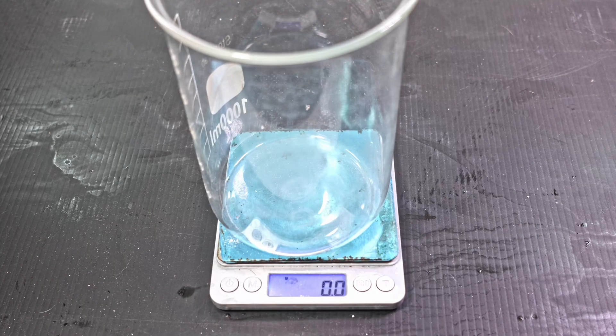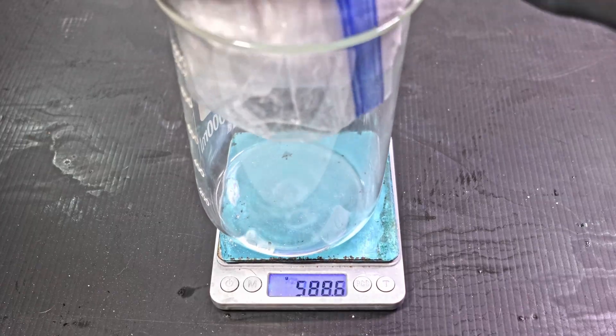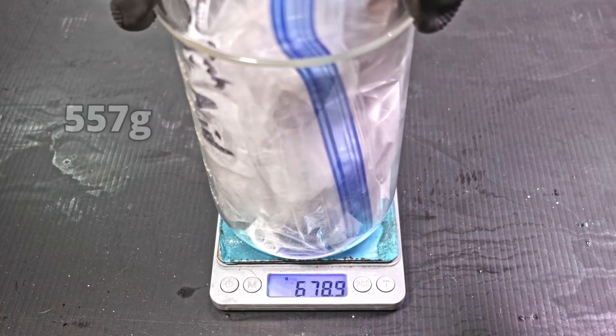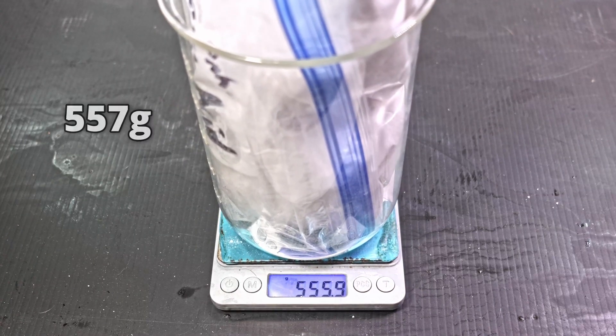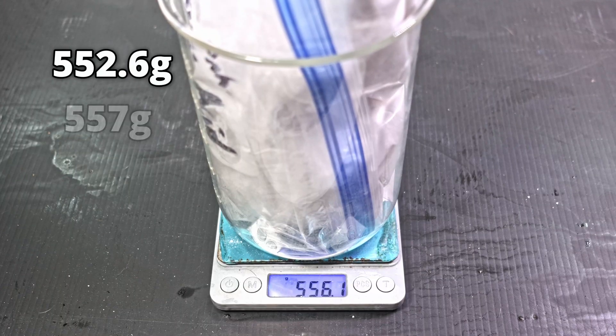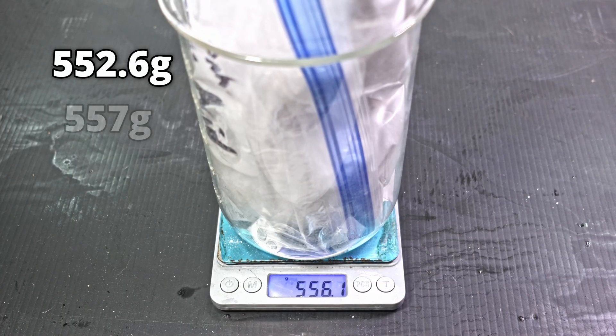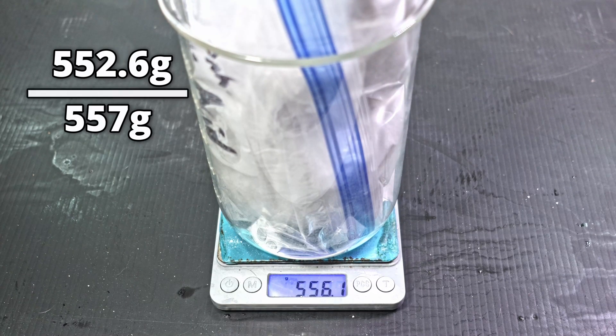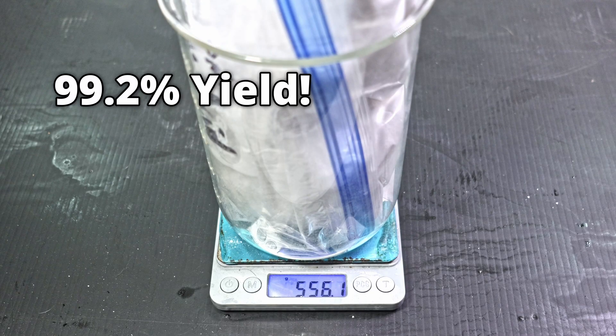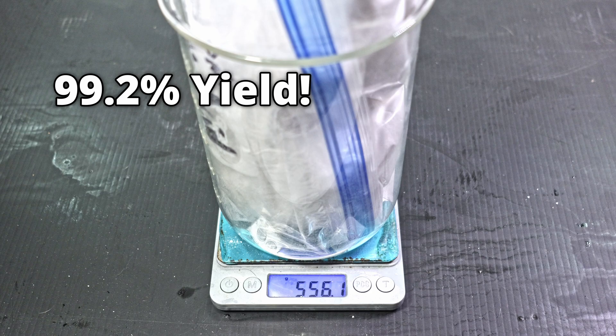Once I finish dehydrating all three of my 260 gram portions, I weigh it. The ideal weight is 557 grams. Minus the bag, I have around 552.6 grams of anhydrous oxalic acid. That is approximately a 99.2% yield. This is the method used in organic synthesis, and there is no doubt it is the best.